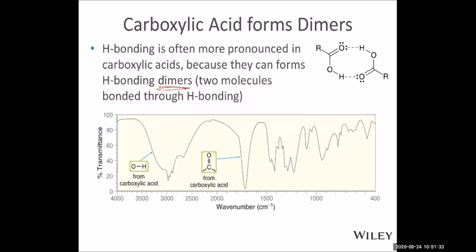So how can I use IR to differentiate these two? This first reactant has a CH on the double bond. First reactant has CH in the double bond. And in the final product, there's no hydrogen on the double bond. And the CH on a double bond has a very unique absorption, fairly weak, sharp, but unique, around 3100 wave number. So by monitoring how much signal there is at 3100, that can tell us how much of the reactant is being converted into product. So that's where, in the first step, you can use the CH bond, because in the product, there's no CH bond on the double bond.